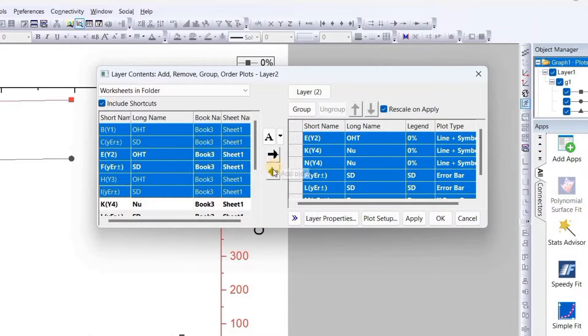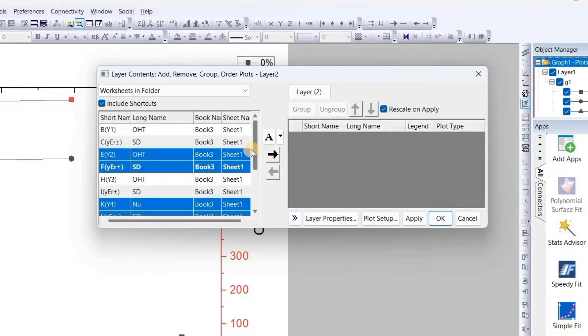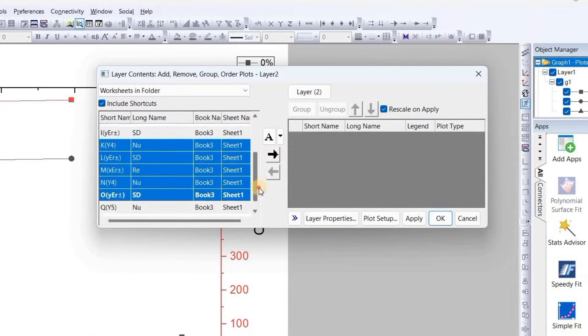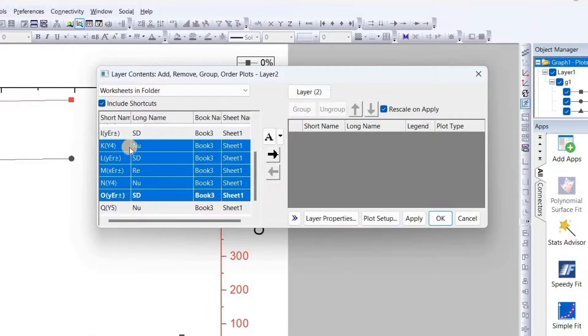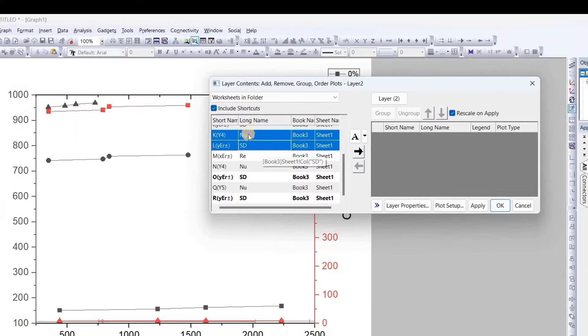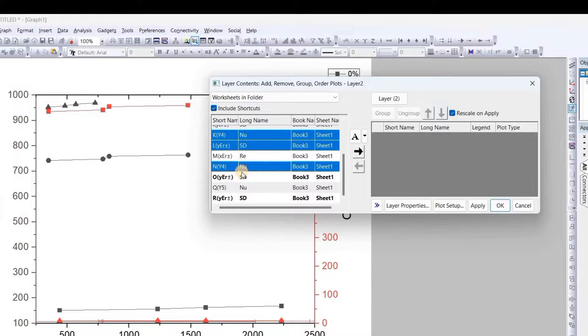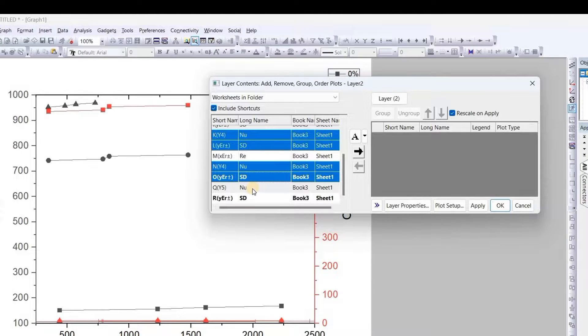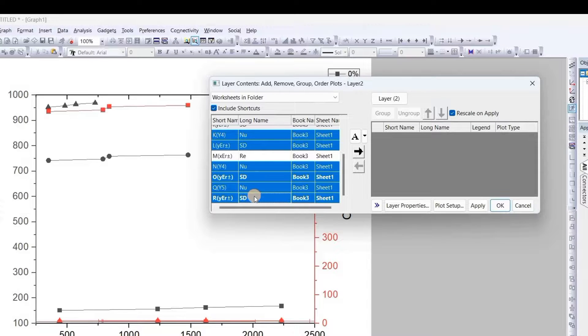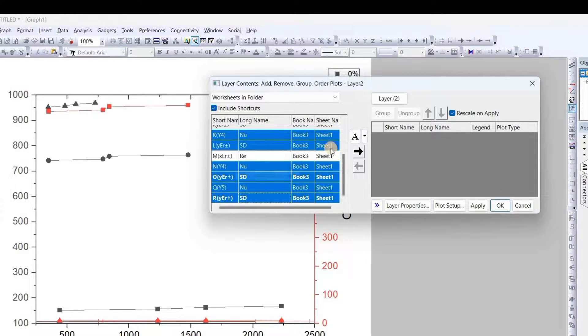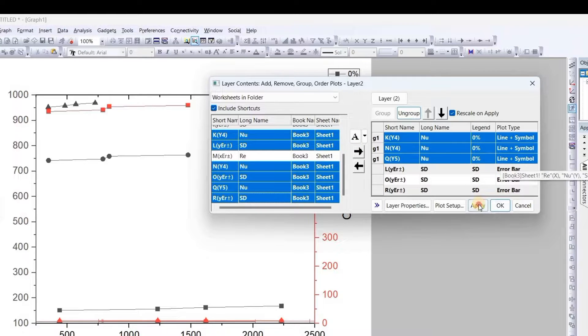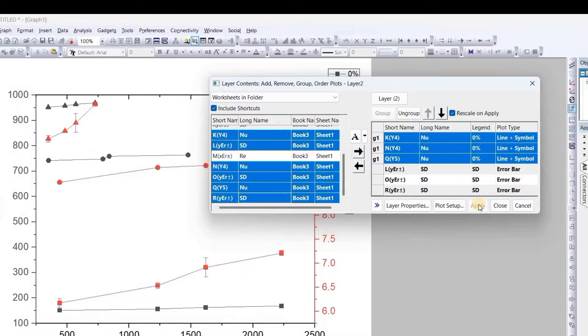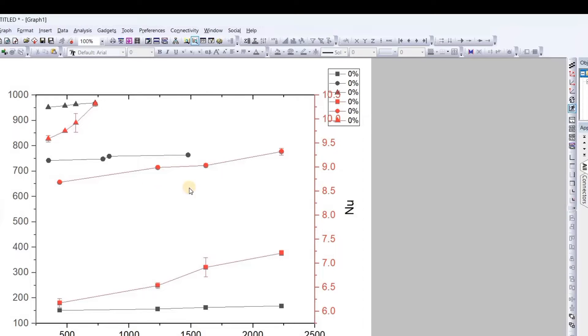Now we will go to layer 2. We will do the same thing: first ungroup it, select all, bring it back here. Okay, now as we see here, we will select K, L, N, O, and Q, R. We have selected these three values. We will bring it to the right side.